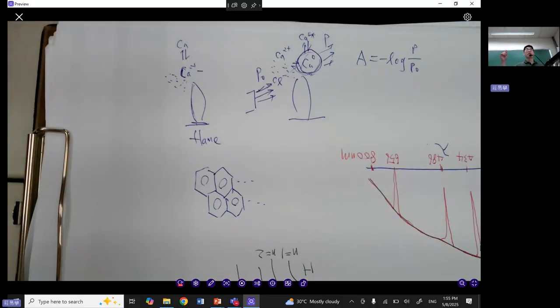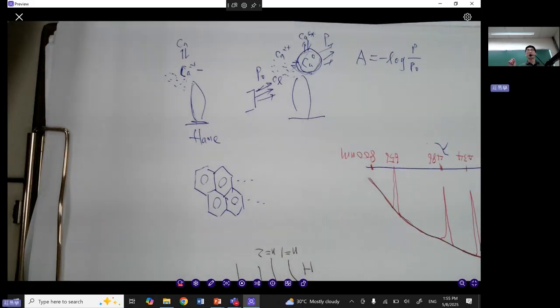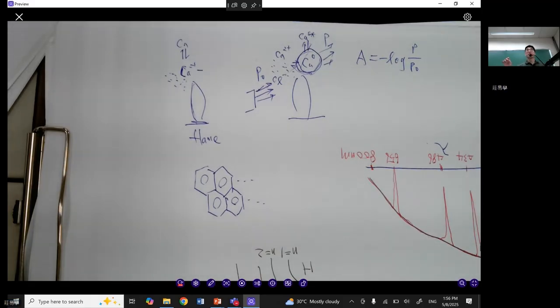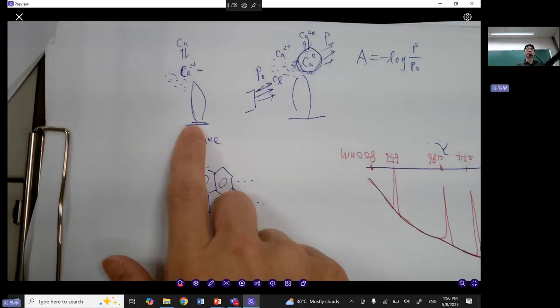So when you apply an electric potential onto it, it acts as a resistor. When you apply voltage on top of it, it generates heat. It acts as a resistor, so it generates heat, and as a result the temperature increases. So using this, we can supply the sample with external heat, and the function is similar to the flame.